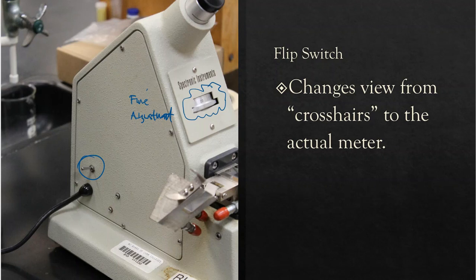So you've already lined up the light half with the dark half. That's pretty easy to see, but that dividing line might be a little fuzzy to you. And if it is, then you need to dial that meter either to the left or to the right, and you will see that dividing line get very, very sharp. And that's what you want to see. You want to see a sharp dividing line, nothing fuzzy, nothing smeary. So if it does show up that way through the eyepiece, that's the purpose of the front dial.